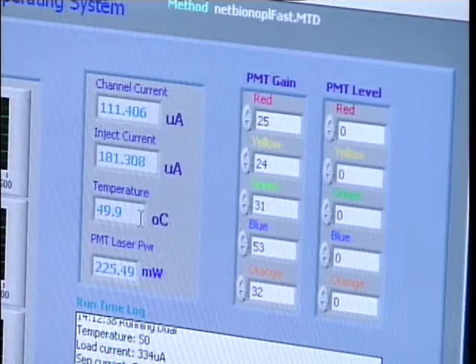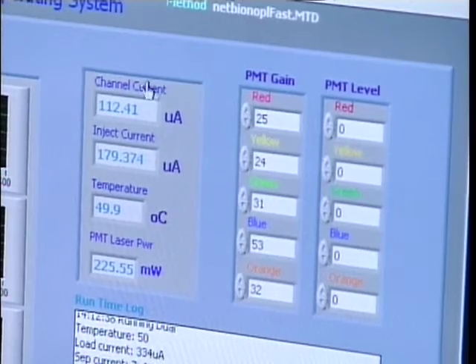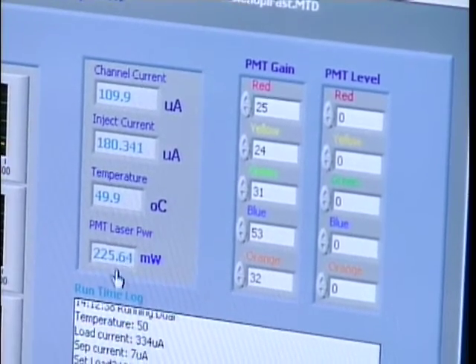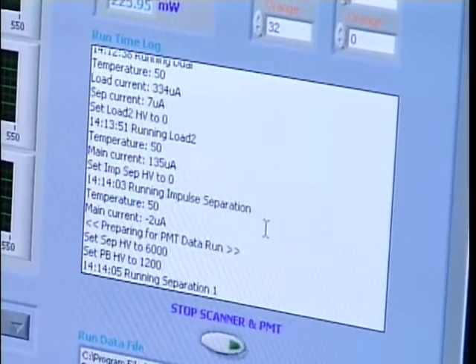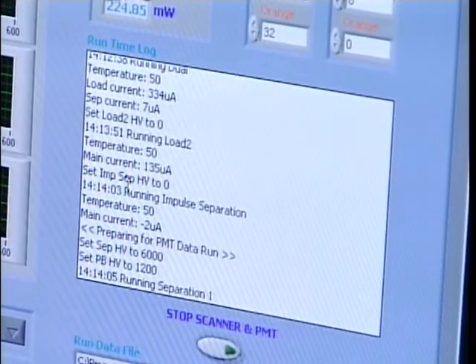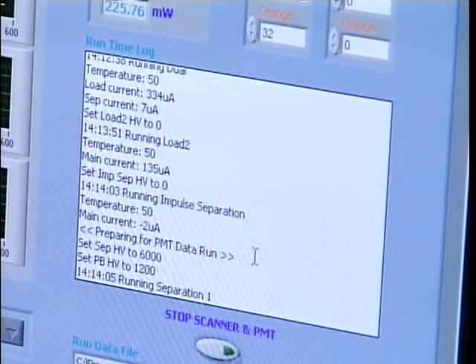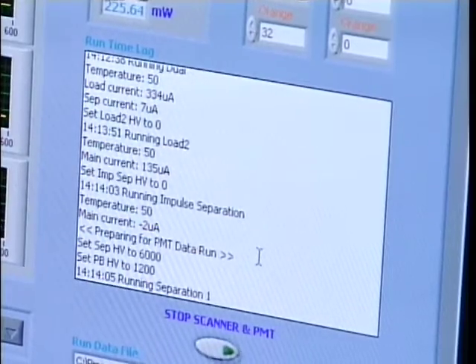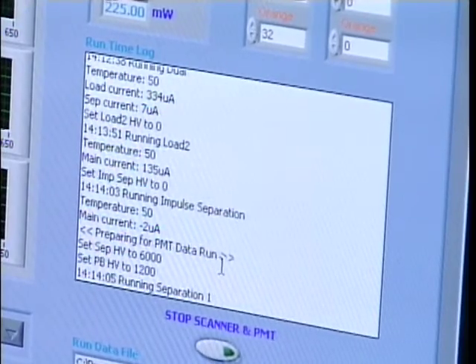Another portion of the operating window reports the laser power, the chip temperature — maintained very consistently throughout the run — and the currents of the separation channels. A third box reports runtime events with a timestamp, the current step, temperature, and current, so the user has a clear picture of what is taking place as the controller steps through each operation.